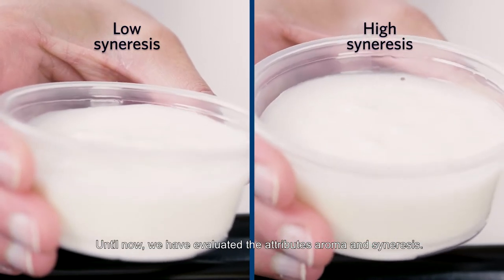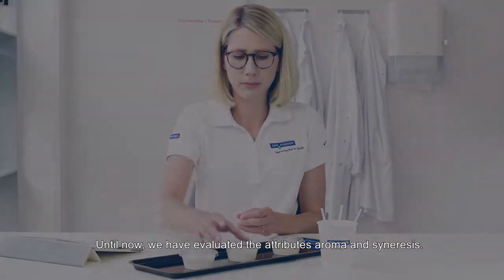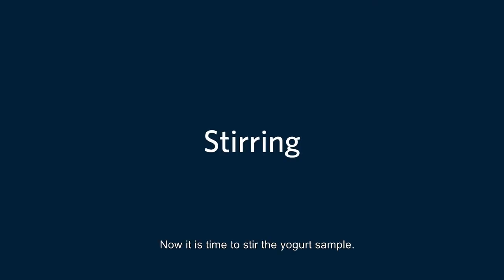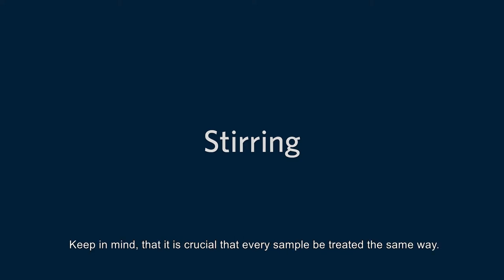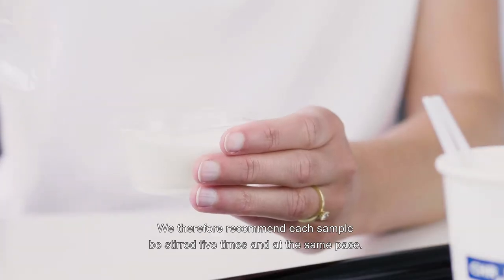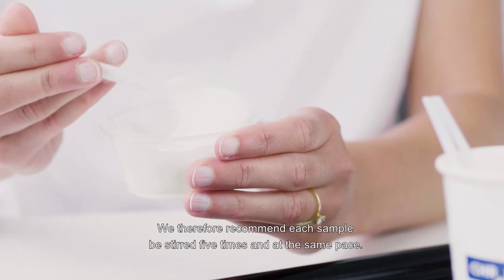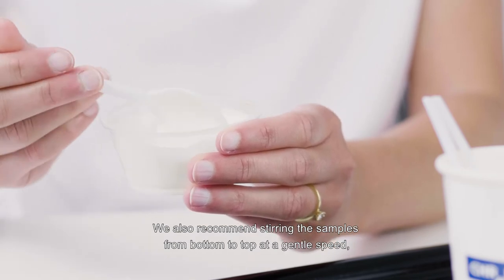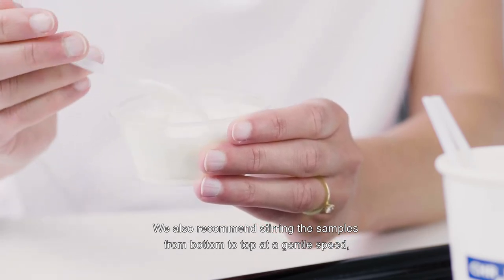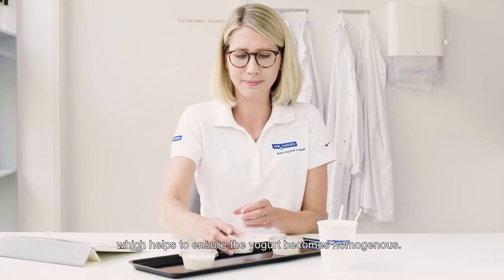Until now, we have evaluated the attributes aroma and syneresis. Now it is time to stir the yogurt sample. Keep in mind that it is crucial that every sample be treated the same way. We therefore recommend each sample be stirred five times and at the same pace. We also recommend stirring the samples from bottom to top at a gentle speed, which helps to ensure the yogurt becomes homogeneous.